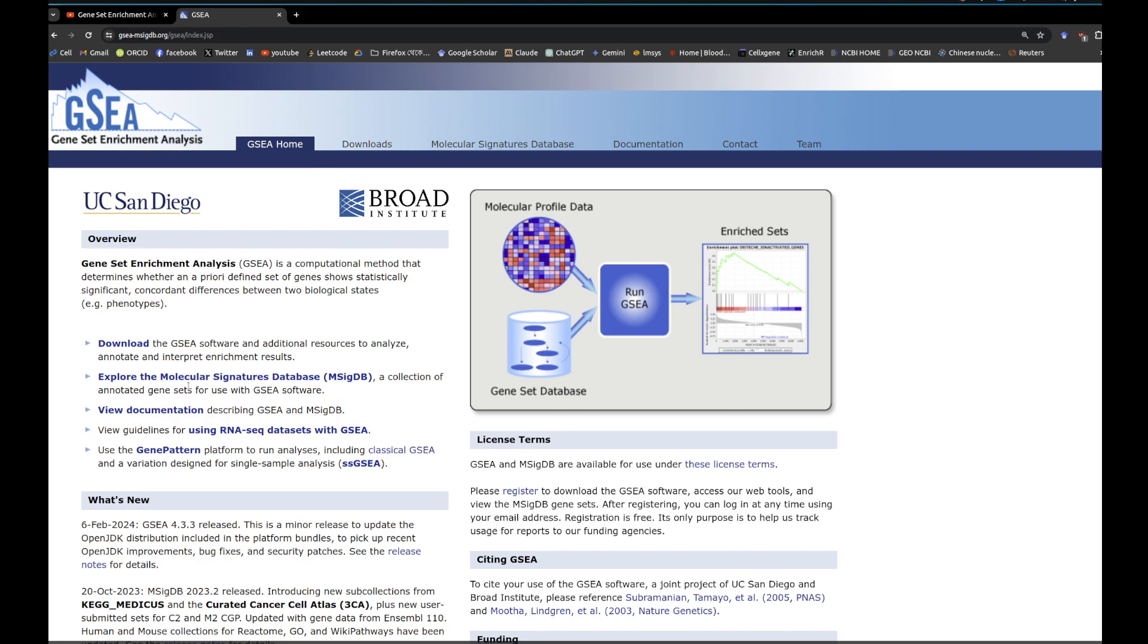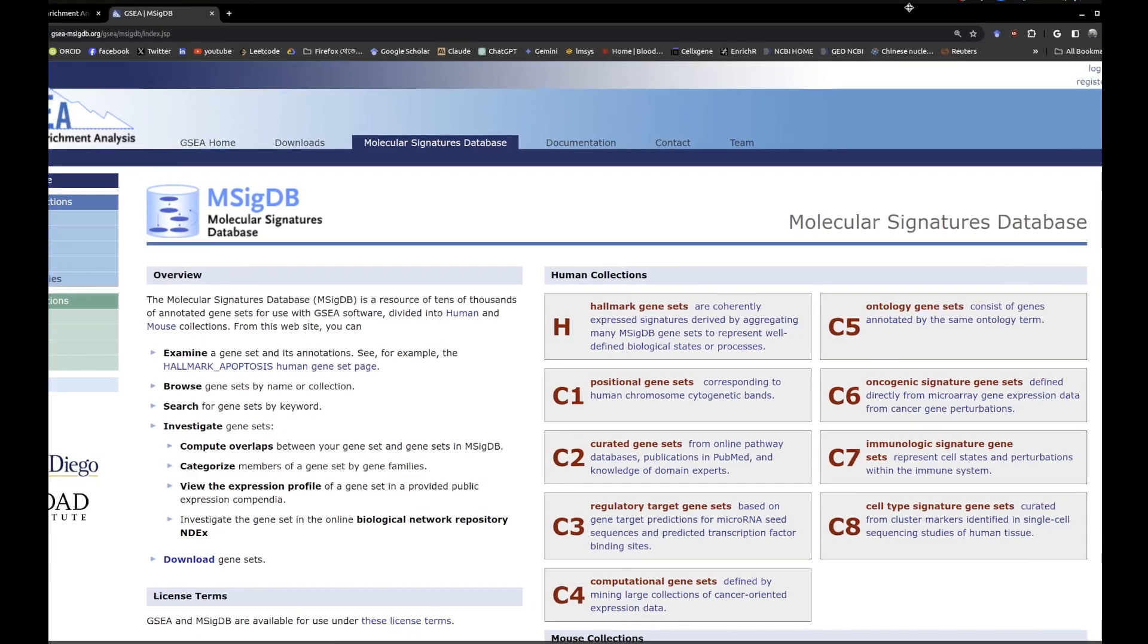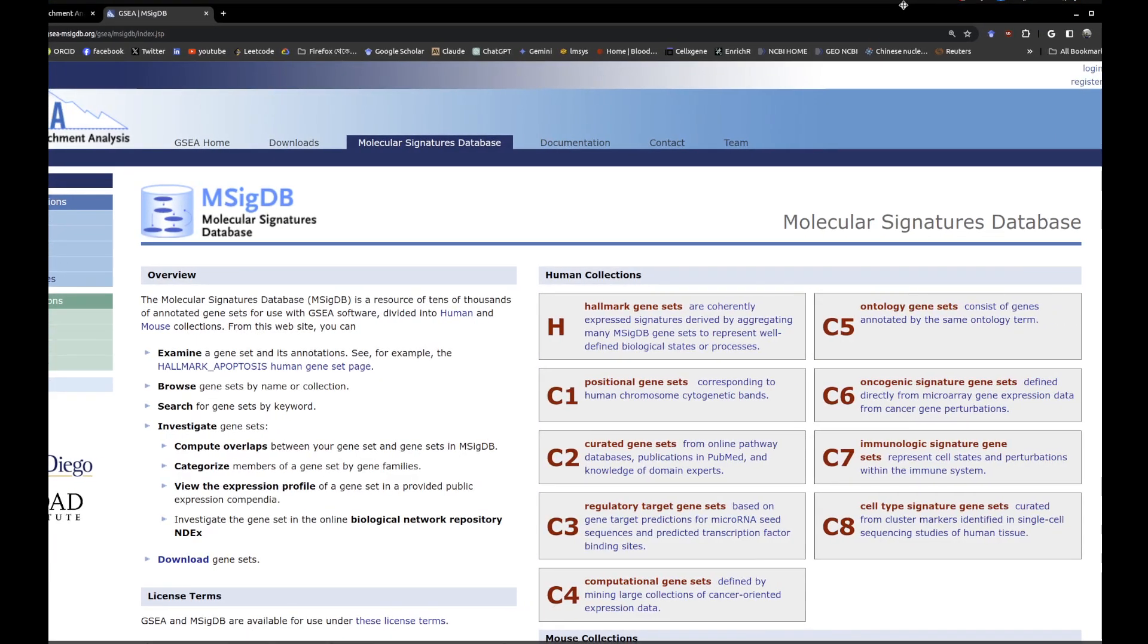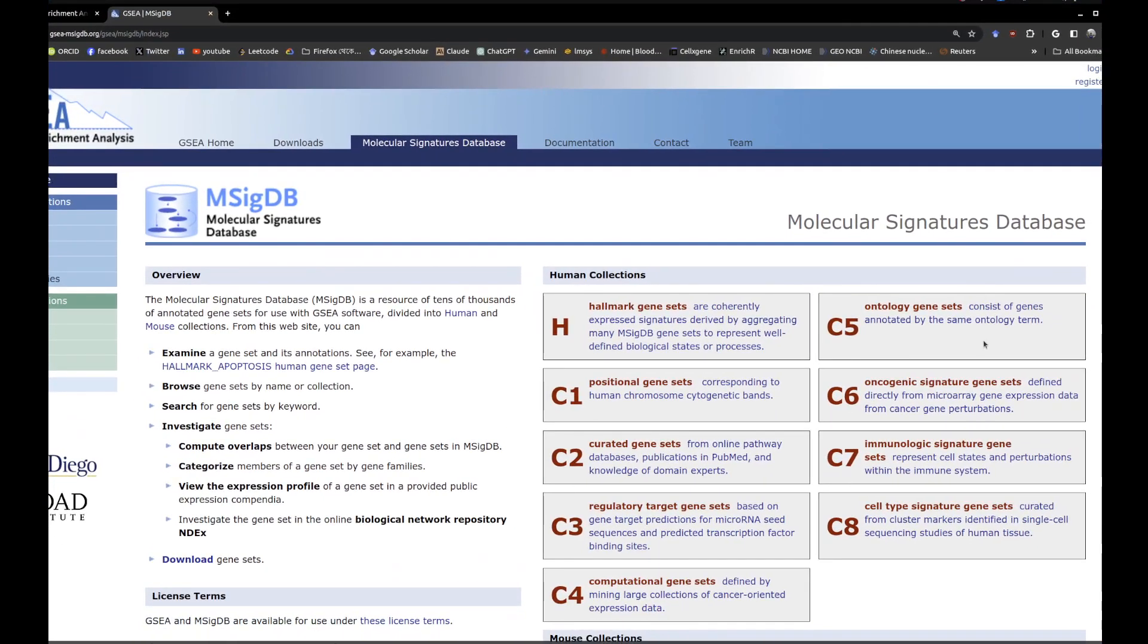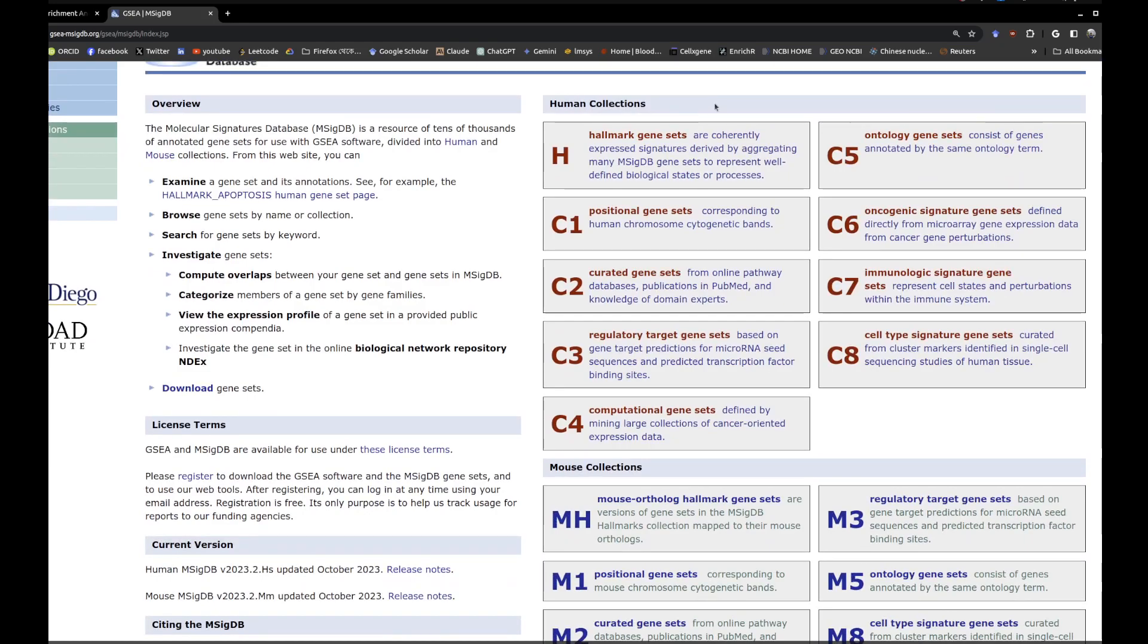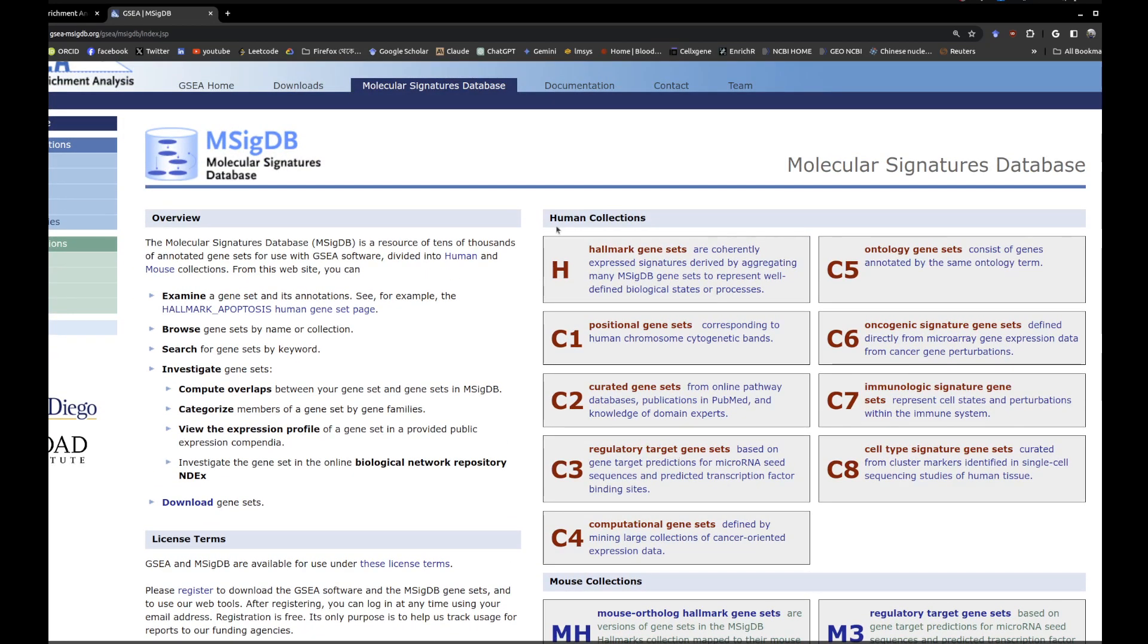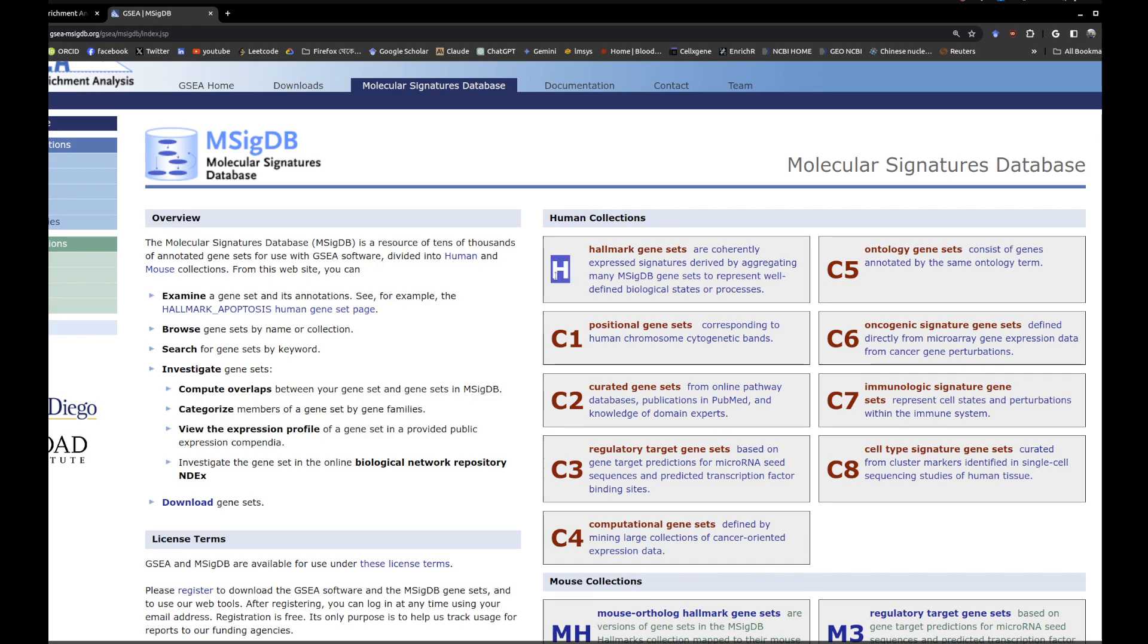Now you can see there is something called the Molecular Signature Database, or MSigDB, and all these in here are curated lists of collections for human and animals. They have their own lists. For example, you want to run your genes list after differential expression against H, C1, C2, C7 or multiple.